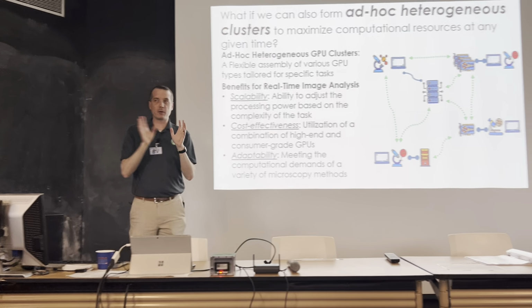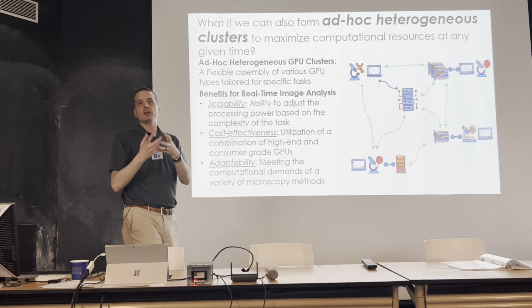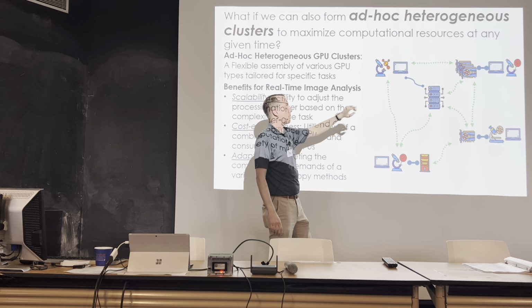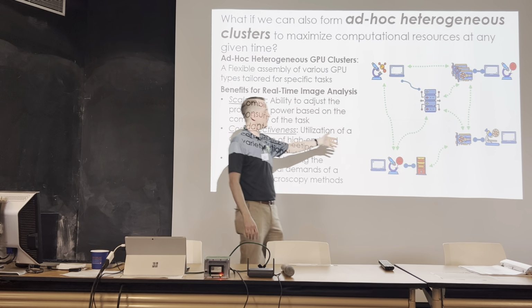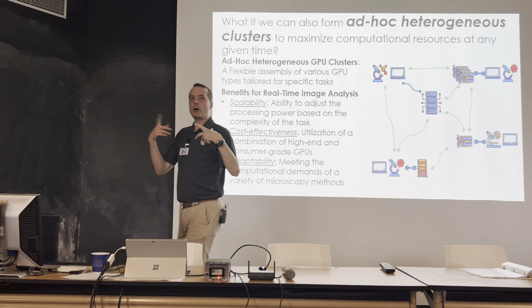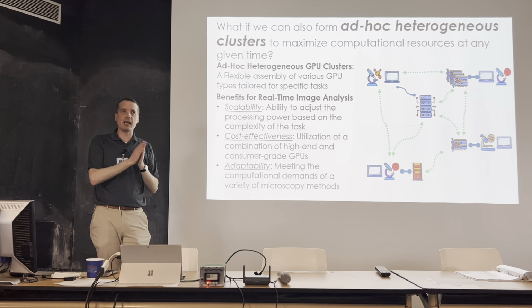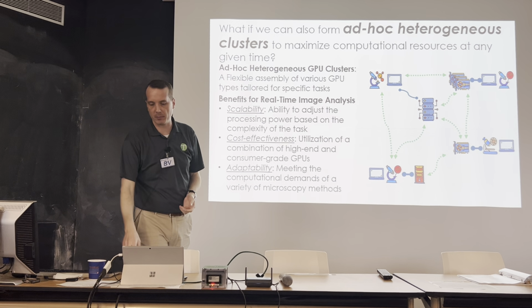So if you were fortunate enough to be an institution that had one of these on every single microscope, could we use them collectively together to create an ad hoc cluster? Say this microscope was down, but can I still use the GPU that was there to run my models when I'm over on this microscope instead, right? Maybe this one is an Orin, but this one up here is a workstation. Can we still pool all those resources so that we're maximizing the hardware? Well, the answer is yes, you can. But in our context and for our software, can we do that? The question isn't really binary, it's how many can we do, and how many different kinds of hardware can we put into the system?